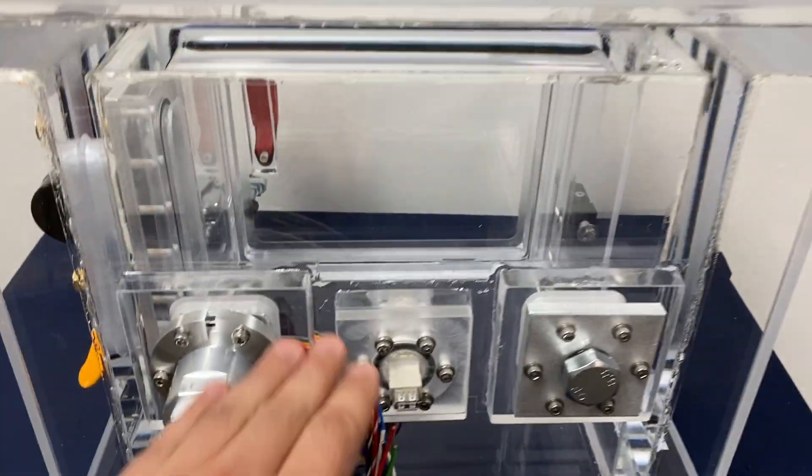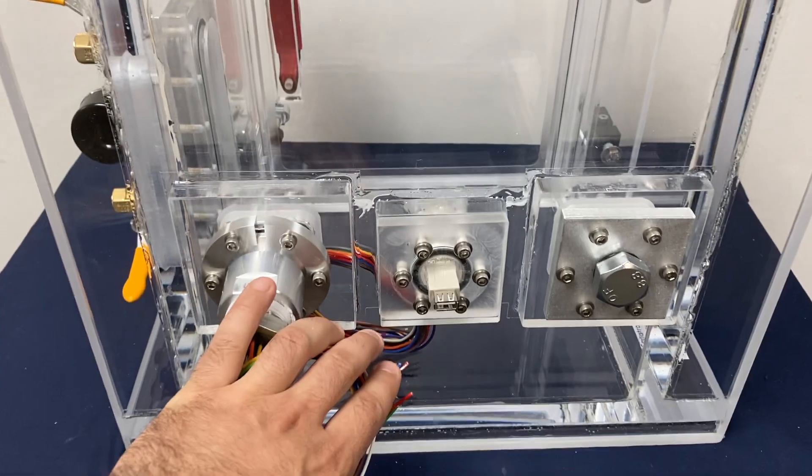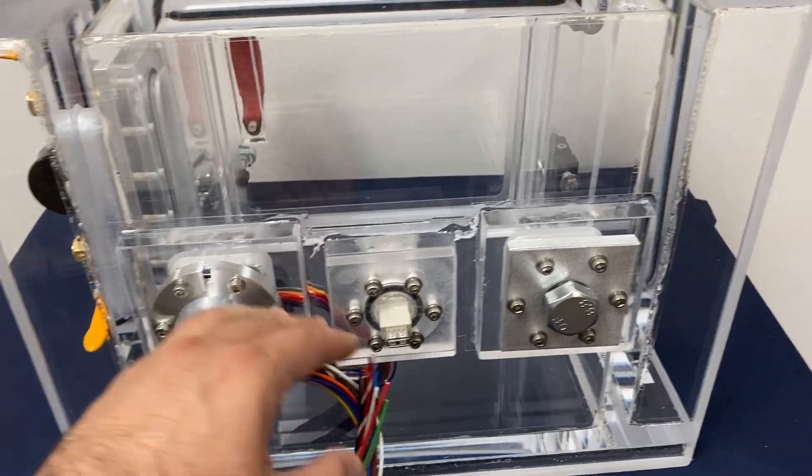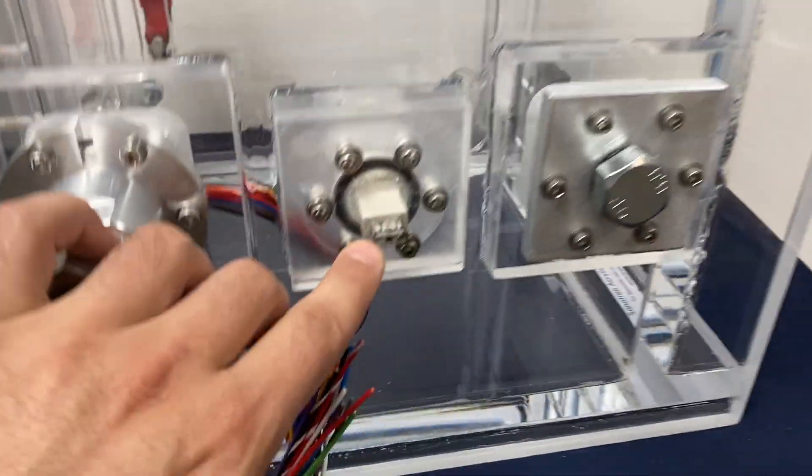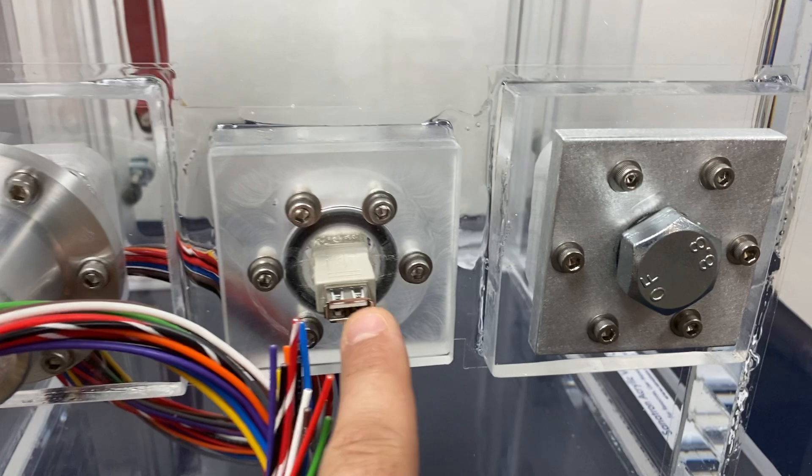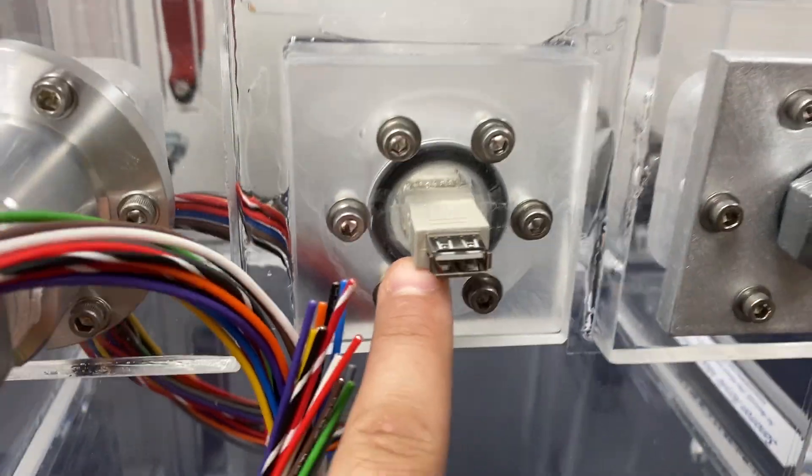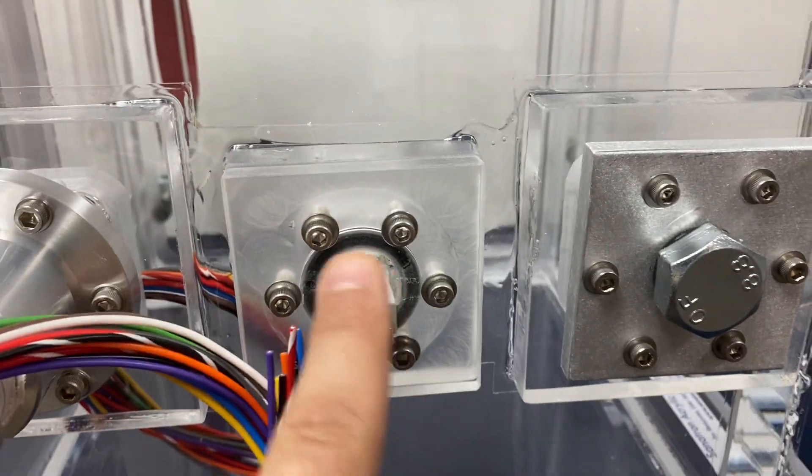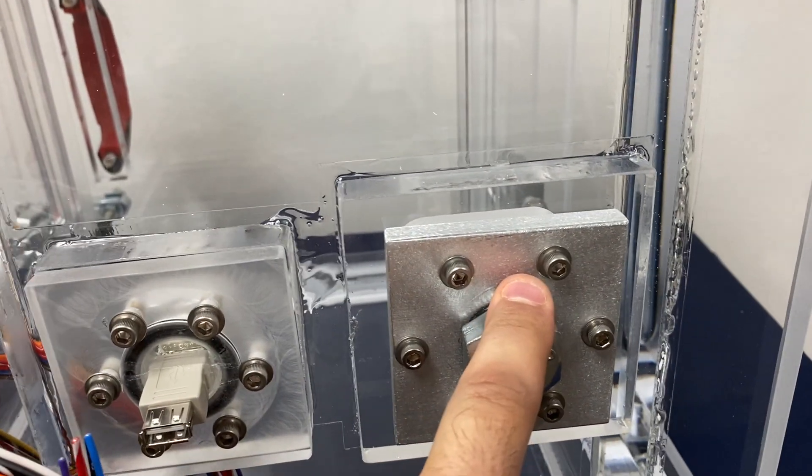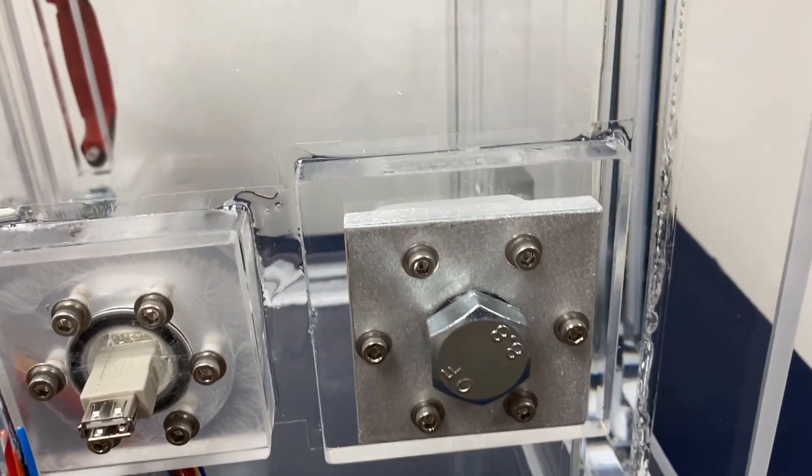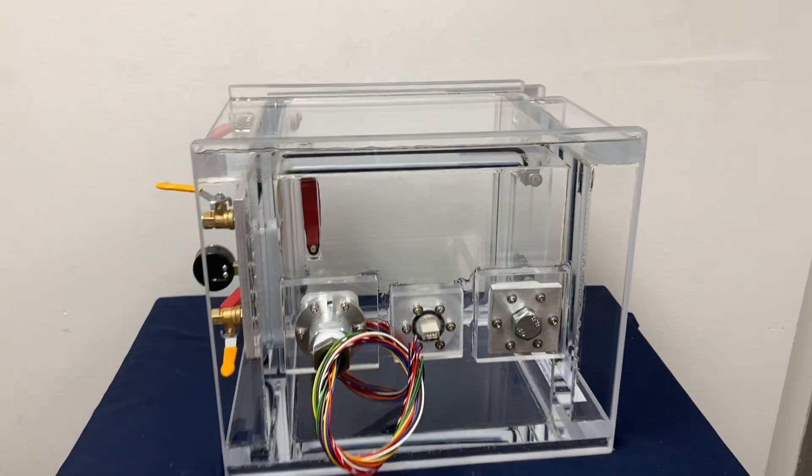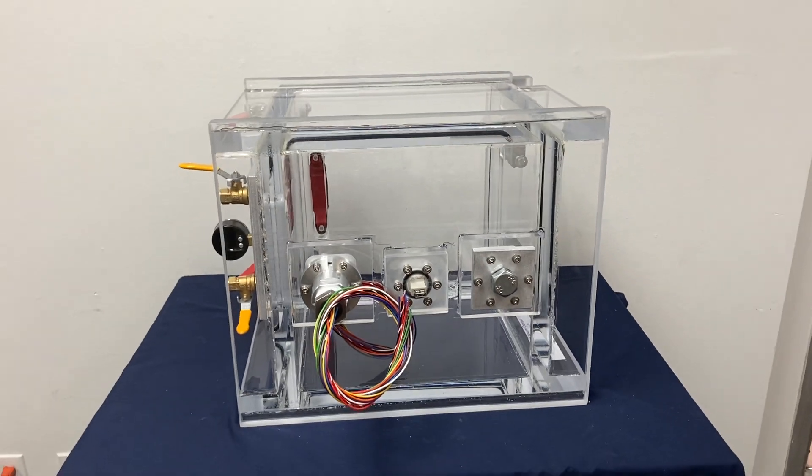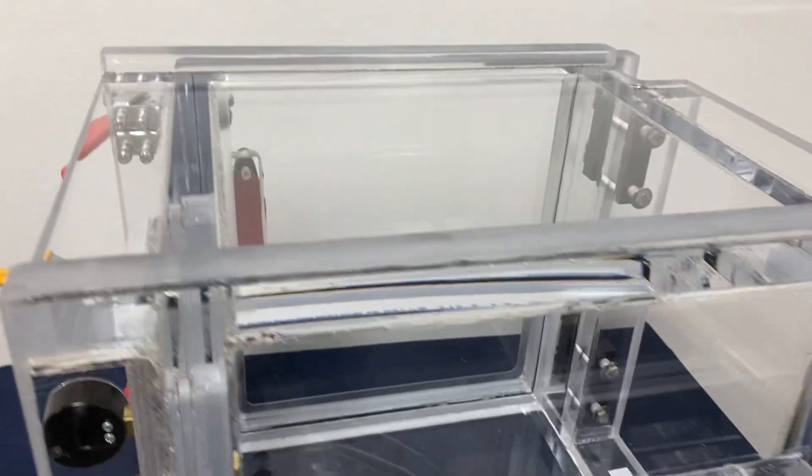And then we have the USB feed-through, and you can see you can add your USB connection right here. And then we have our custom threaded feed-through, which is this thread right here. So this is how it looks like from the rear wall.